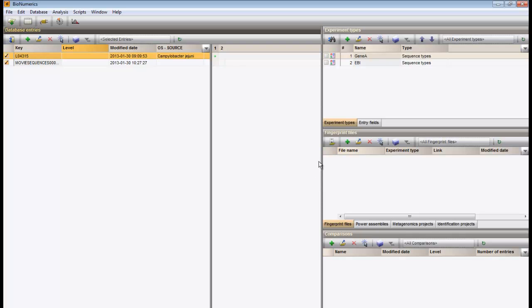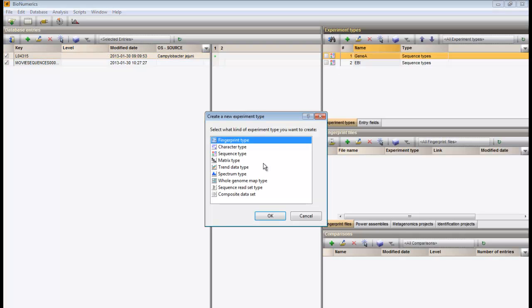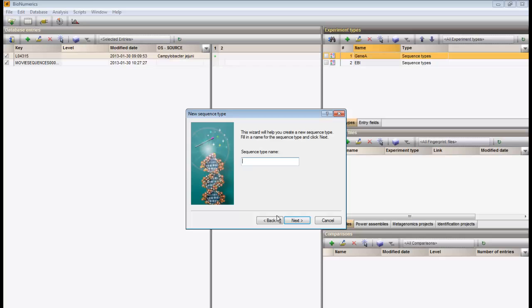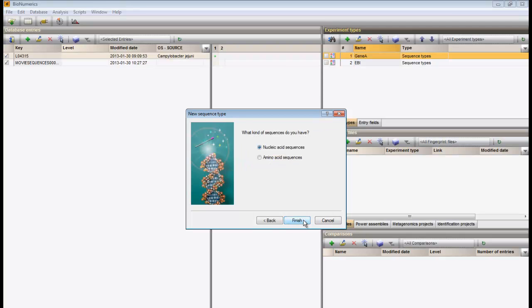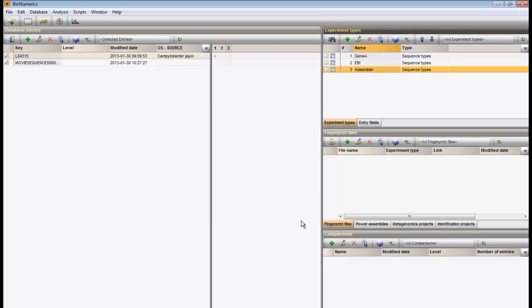I create a new sequence type experiment, and this one is for nucleic acid sequences.